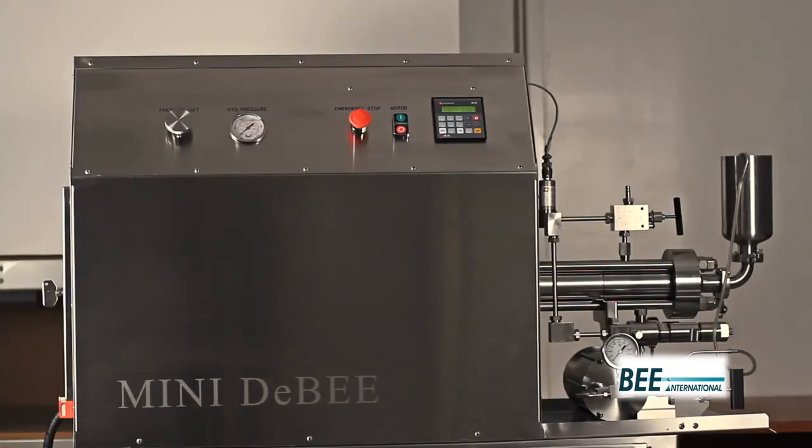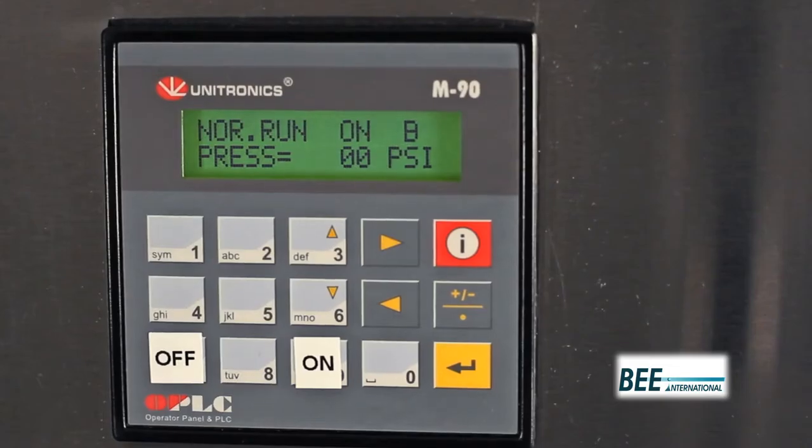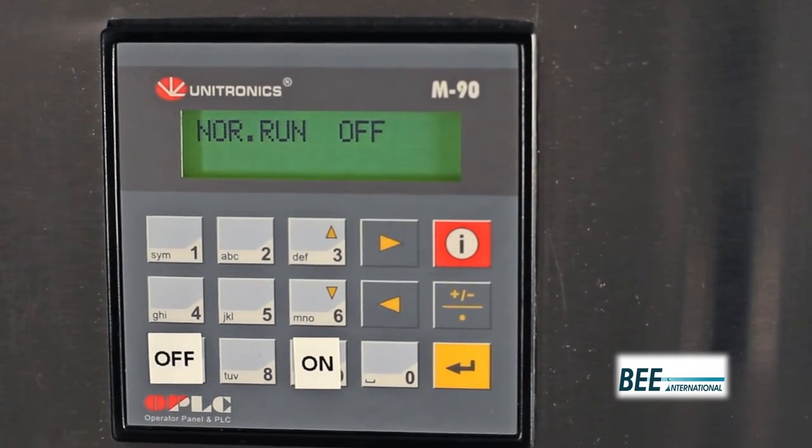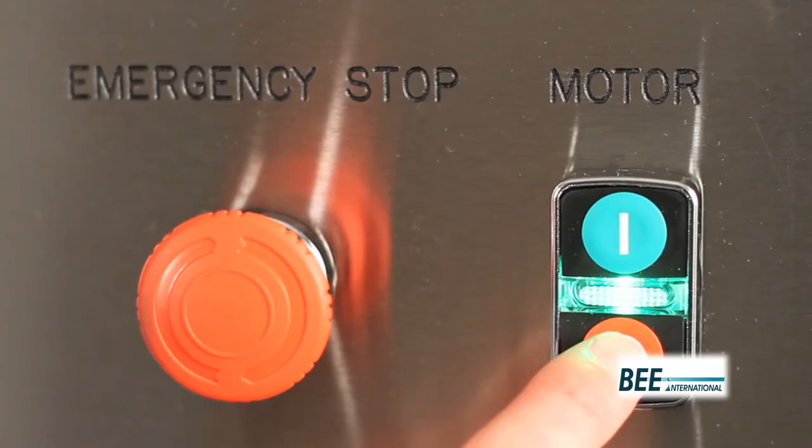At the end of operation, turn the pressure set dial counterclockwise until process pressure reads zero and press off on the PLC to turn off the intensifier pump. Turn off the motor button.